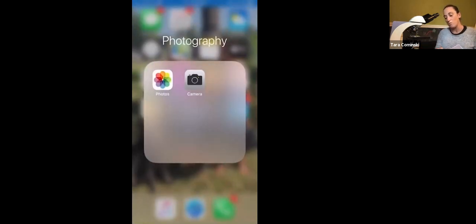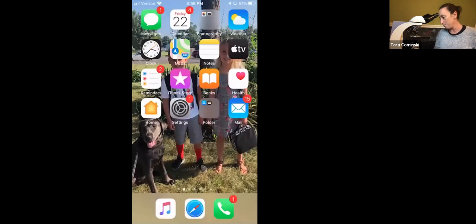For this, if you look at that table, you're just completing that table. We want to know which one's on top, which one's in the middle, and which one's on the bottom. The top is the blue, the middle is the red, and the bottom is the yellow. Okay? All right, so let me stop my share. I have to share one more time because we have one more thing to do, and then we're all done.